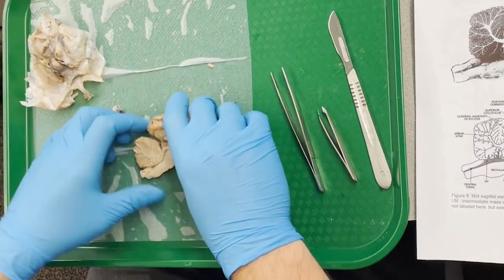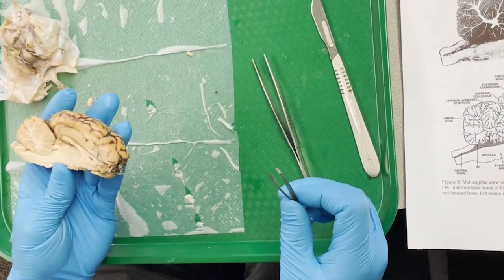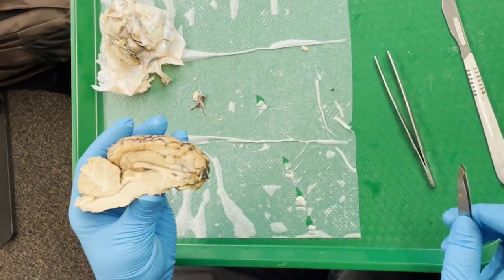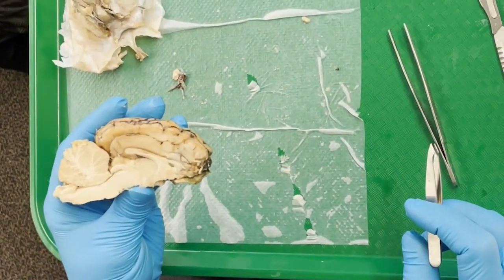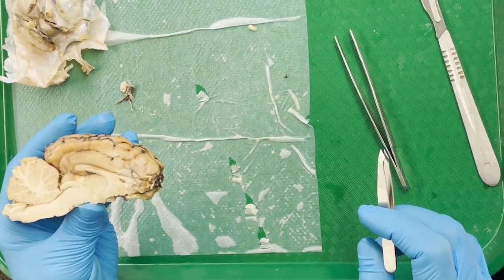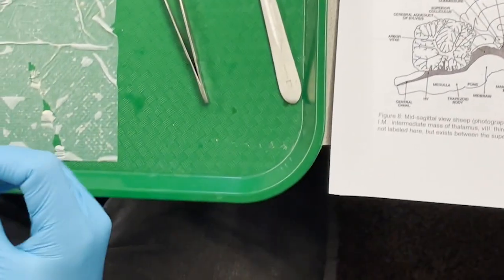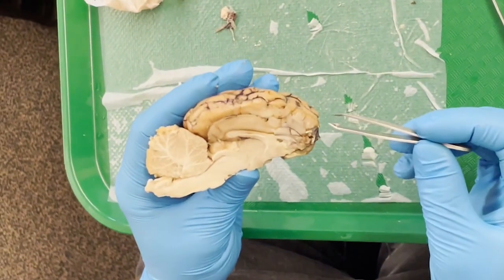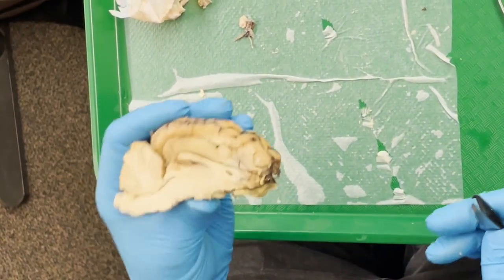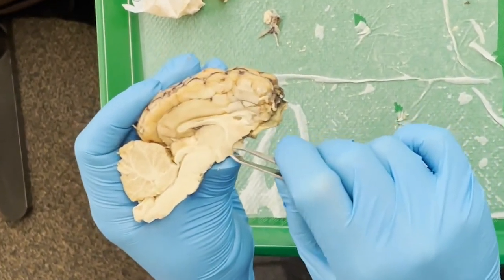So taking a closer look at this, we have a lot of stuff that we could look at. Towards the middle-ish part, you should see a relatively circular shape that's a little bit darker gray color. And that is what the IM refers to in the diagram on page 9. You can use that diagram to help ground you onto where you're trying to look here. So the IM is that larger sort of grayish type area. You may or may not be able to see the cross section of the optic chiasm. It depends whether it pulled off or not. It normally, in this case, should be here.